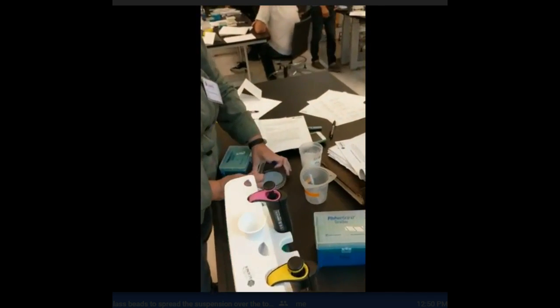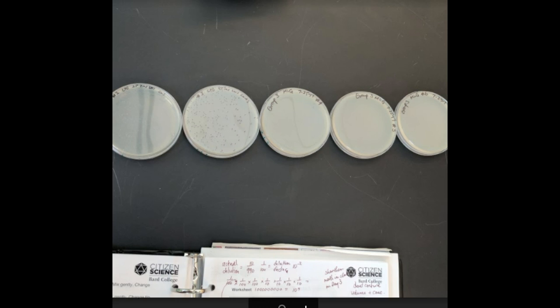Immediately pour the mixture onto the agar plate and swirl the plate gently. Do this one tube at a time to reduce the cooling of the top agar. To reduce contamination problems, start with the most dilute phage samples, then proceed to the less dilute ones. In other words, start at tube 7 and go to tube 6.